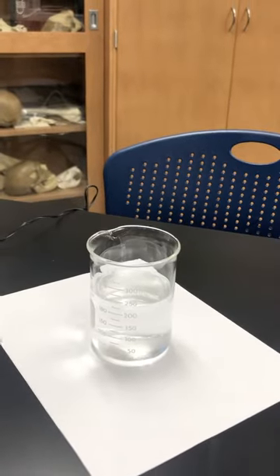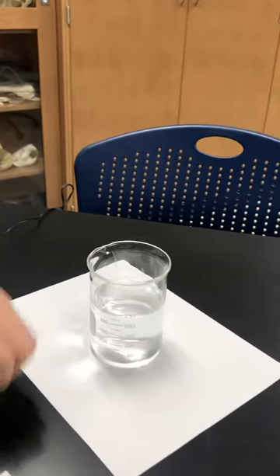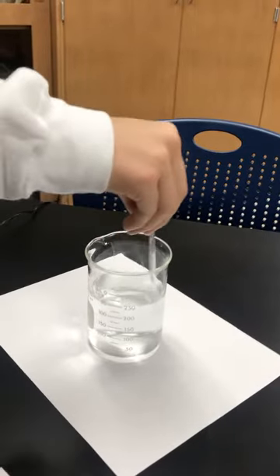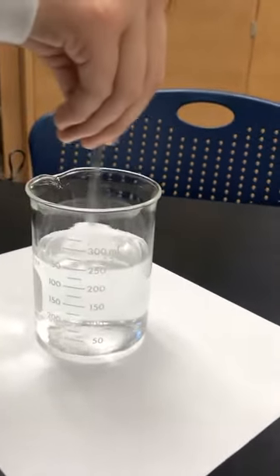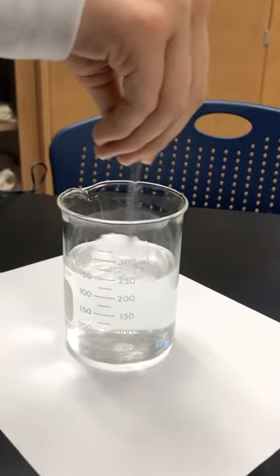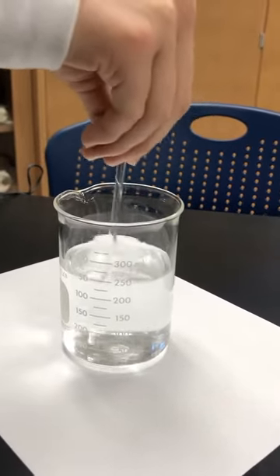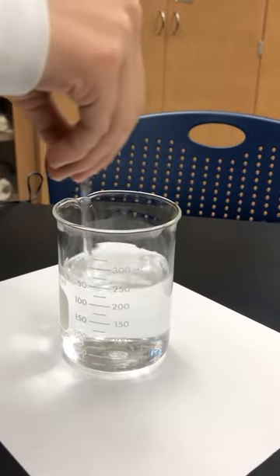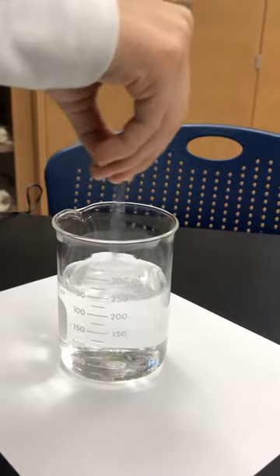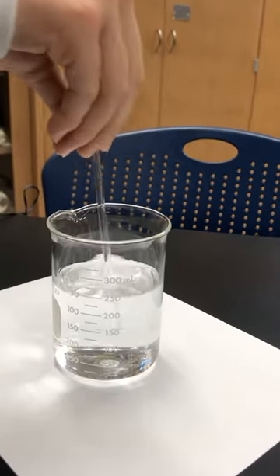Now she's going to stir that up using a stirring rod. And you'll notice right here, we're forming a solution. At this point, it's going to be a basic solution because baking soda is a basic substance. So into our 250 milliliters of water, she has just stirred and combined that baking soda.